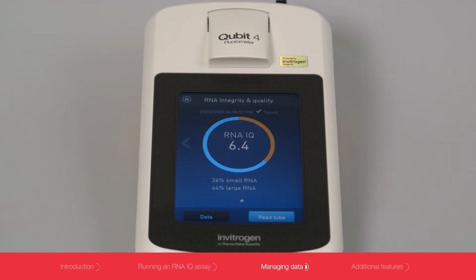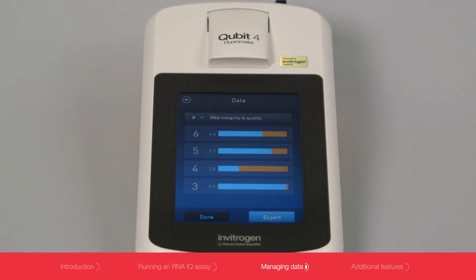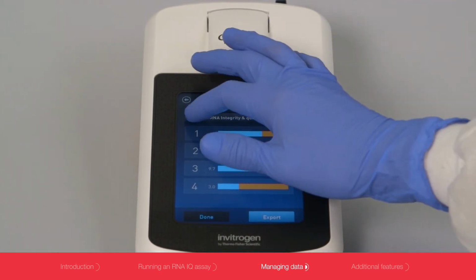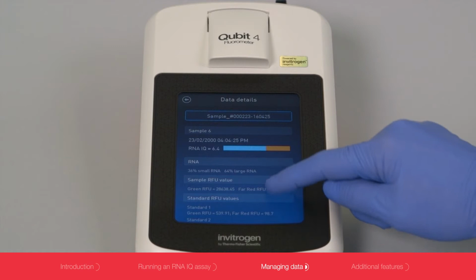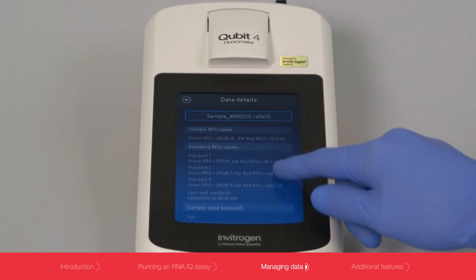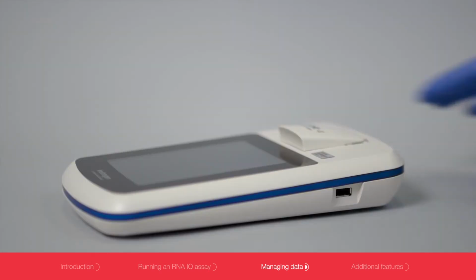You can run additional samples. All of your data are automatically saved in sequential order. You can change the order of the samples. From the data screen, you can also access additional information about each sample: the RNA IQ value, the % large and small RNA, the volume of a sample, and the RFUs for the sample and the standards. Each sample is automatically saved with a unique time-date stamp.